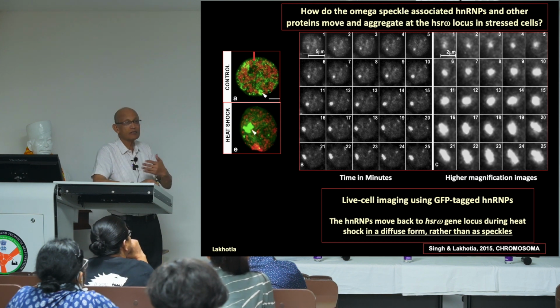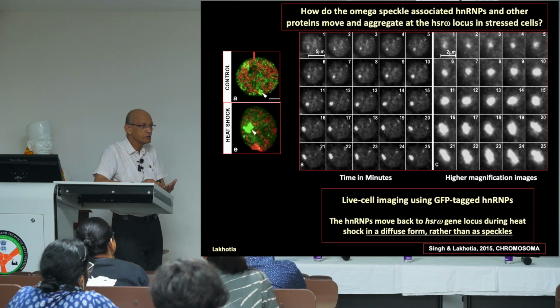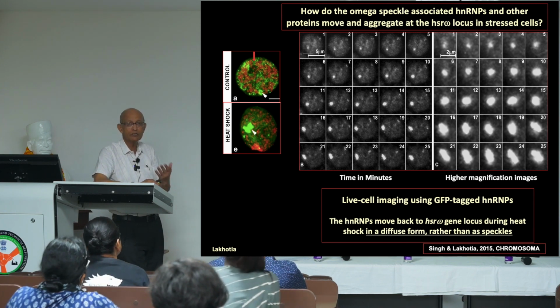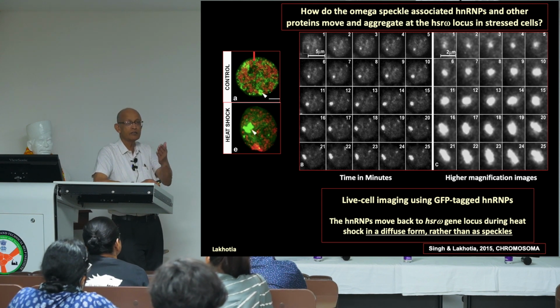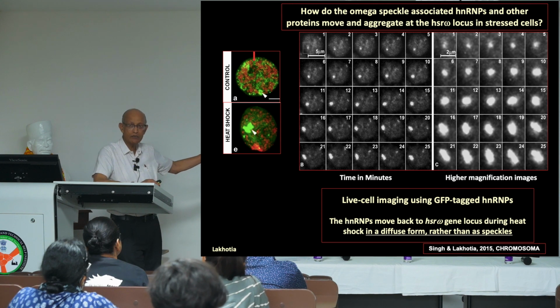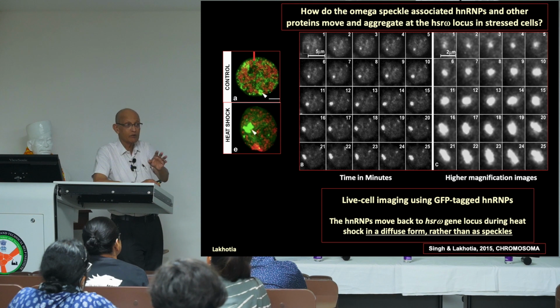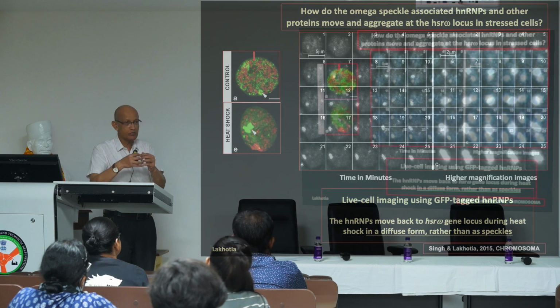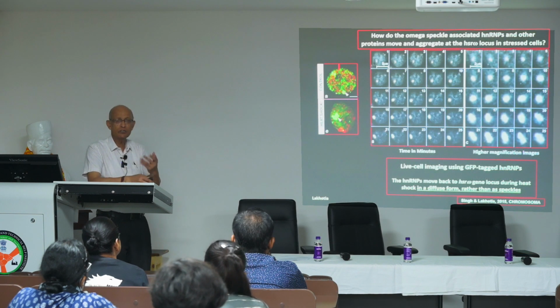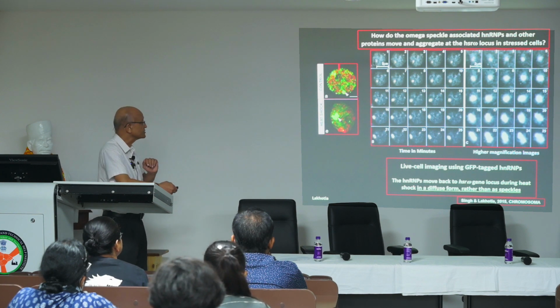You can actually have time going on for a day, 2 days, depending upon what your microscopy system allows you to keep your tissue, your cells alive. Cells in culture can be placed on a confocal microscope, and you can have some fluorescent components there, and you can trace them for a day or 2 days. But of course, on this stage you need to maintain proper temperature, proper humidity, proper CO2 concentration. That means you need a tissue culture chamber on the microscope stage itself. And then one can do that kind of analysis.